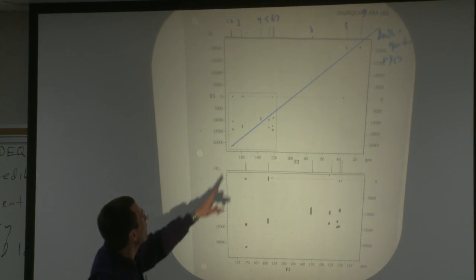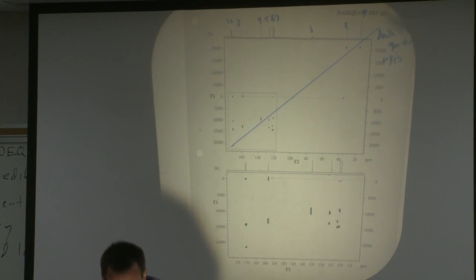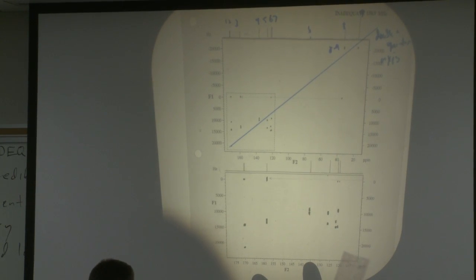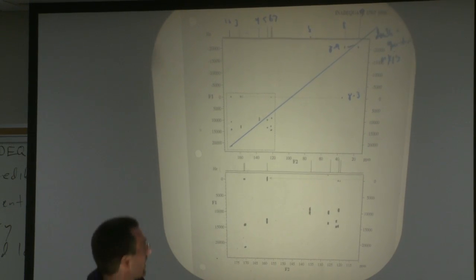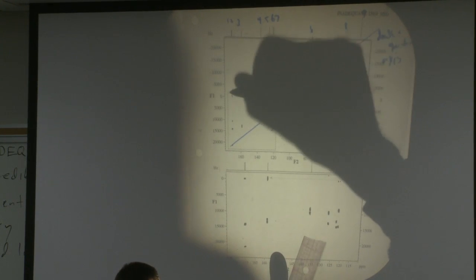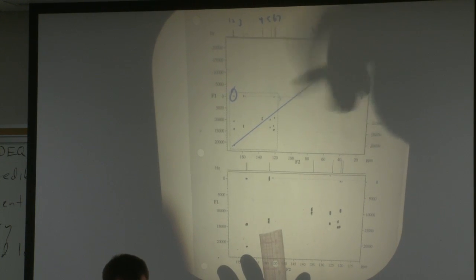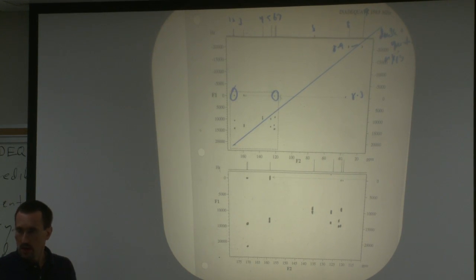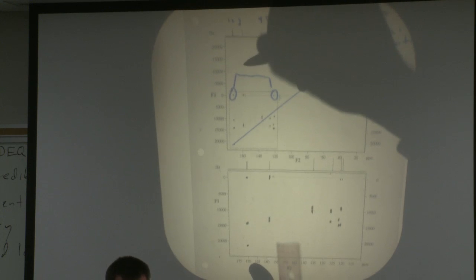Yeah, so, okay. So I want to point out a couple of features. So one feature is, all right, so like here, for example, you can pick up 8 and 9, and it's right across the double quantum axis. And here, for example, they've even drawn a line for you, you can pick up 8 and 3. But what can you tell about this and this spot? And now I've just circled it so badly that I've circled over it. What can you tell about those two? What? That can't be. It may be an artifact, it may be noise, but they're not a cross peak.